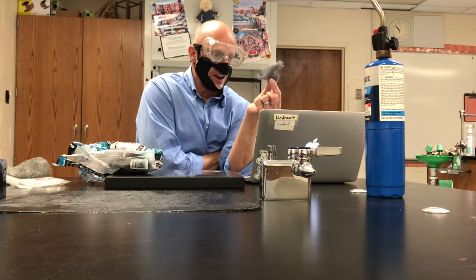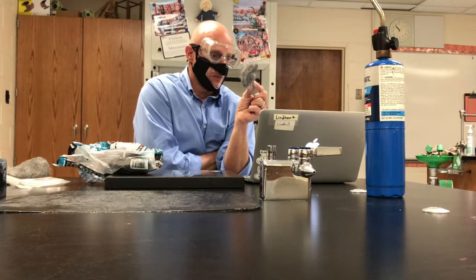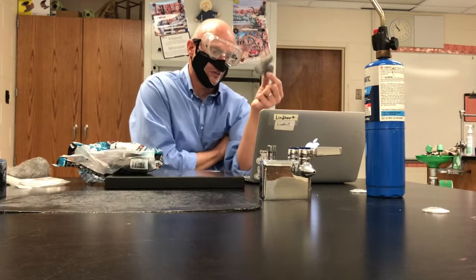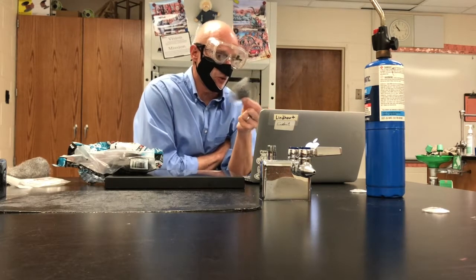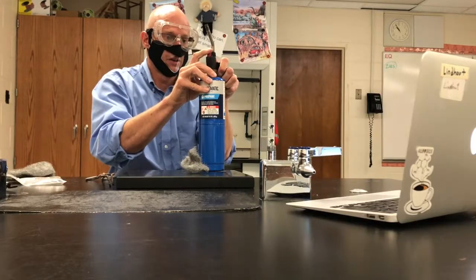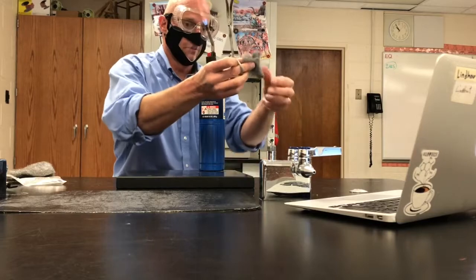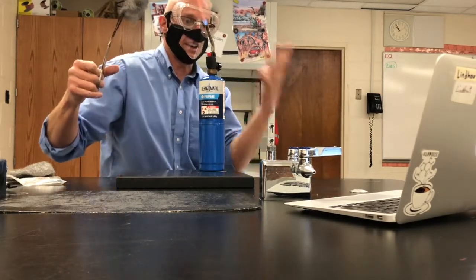So I've got iron particles. That's the only particles I've got. They all look the same. They're all identical. We could represent them with circles. What I'm going to do, though, is I'm going to do a chemical process or a chemical change. I'm going to take my steel wool and I'm going to heat it in the flame.